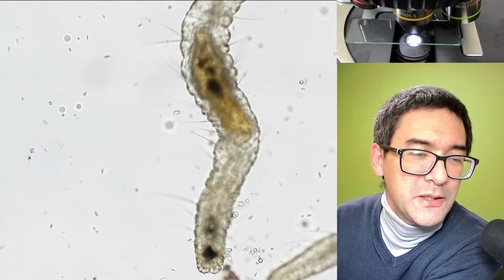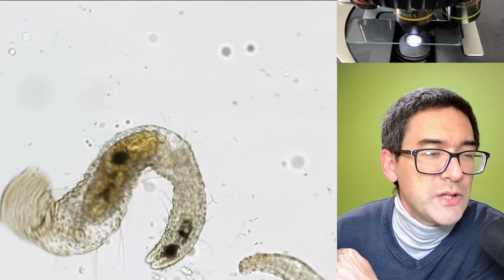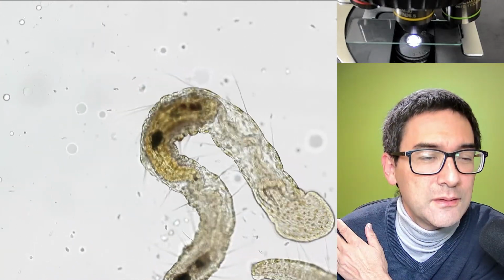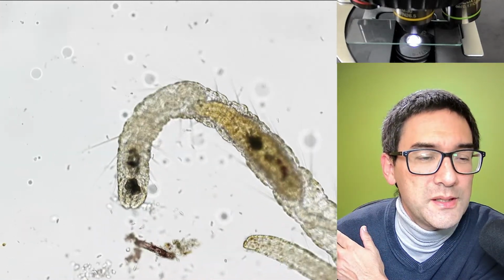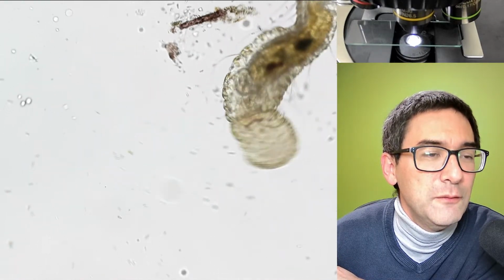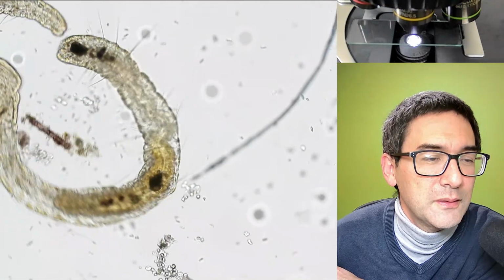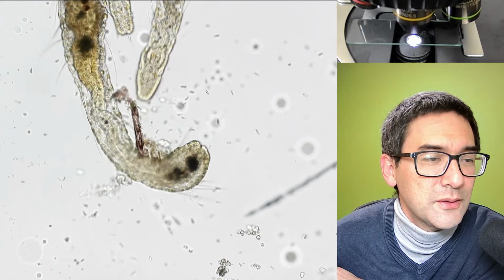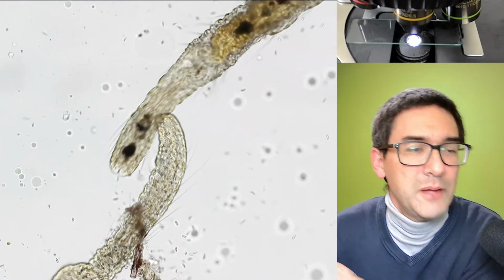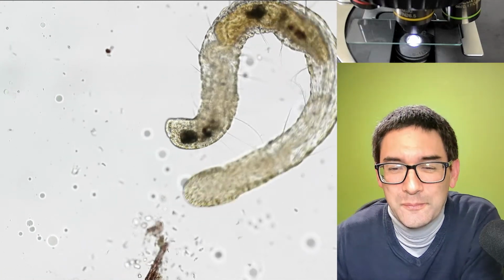Just yesterday, I actually spent quite some time making some nice videos of these worms with a cover glass on top, so you're actually able to see many more details. And the worm is typical because it has those reddish dots all over the body. Yeah? And these dots apparently are oil globules. But it's a little bit difficult to see now because it's moving around so erratically. So, yeah. Also, apparently, not a very big response.